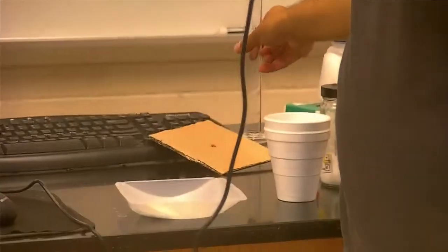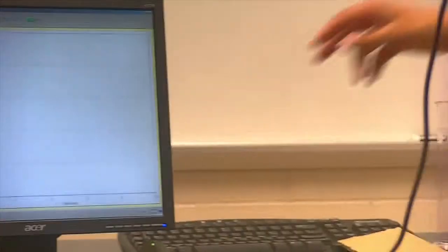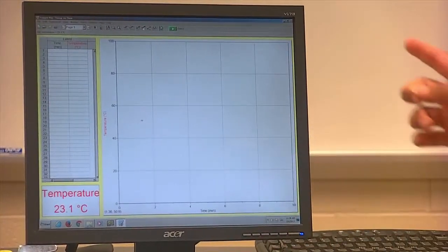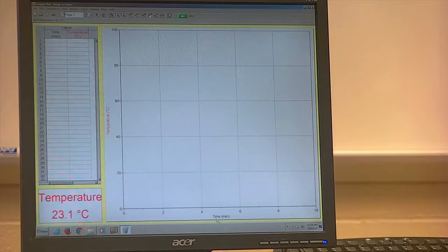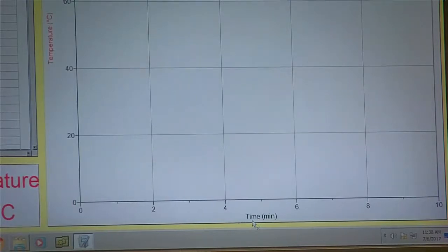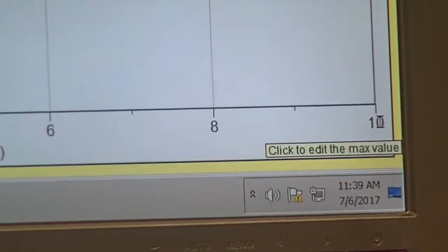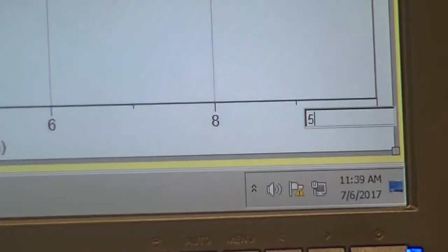Make sure you have your temperature probe connected. Here's my temperature probe, and it's connected to my Go-Link adapter. Your lab manual may have time in units of seconds. 300 seconds is about five minutes, so instead of converting units I'm going to click on that 10-minute setting, change it to 5, and hit enter. The protocol tells us to run this for 300 seconds, which is five minutes.